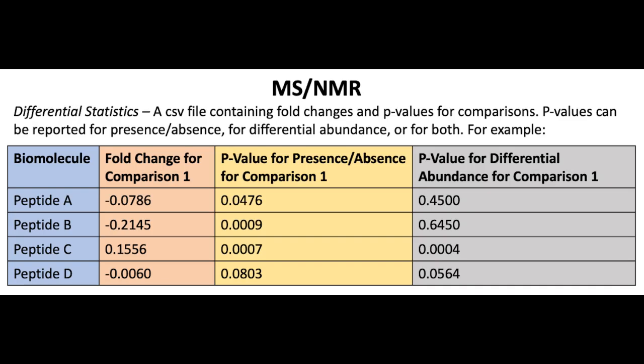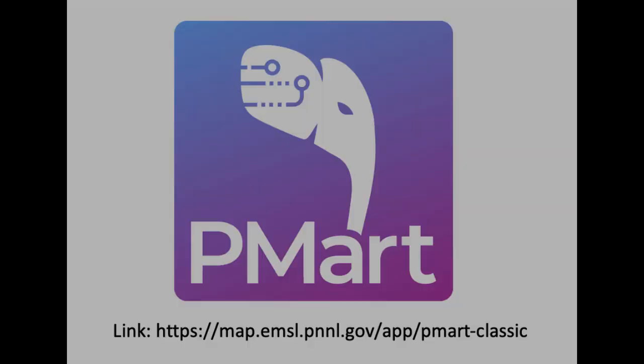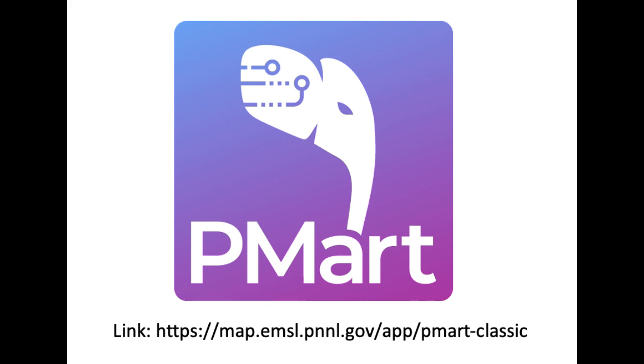The last optional file is the differential statistics file, which is different for MS-NMR data and RNA-seq data. For MS-NMR, there should be one fold change per comparison and at least one p-value for each comparison, which can be from either the g-test for presence-absence or the ANOVA for differential expression. We highly recommend utilizing the Panomics Marketplace or PMart to get these values. Use this link to reach the PMart application.